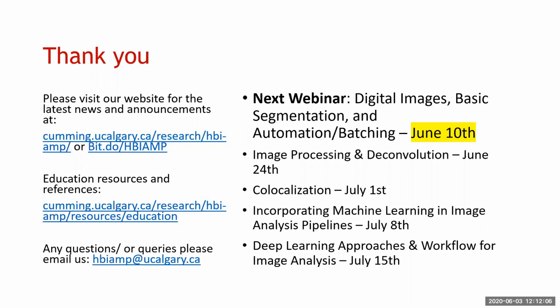Now that is if your sample can survive that, because what goes along with a cover slip is mounting media, and a lot of mounting media have kind of bleaching protection, oxygen scrubbers and reactive oxygen scrubbers to make sure that your dye, or sorry, your secondary at least, will survive the beating that it gets from the excitation source. So you do kind of miss out on that. So yeah, that's my answer to that. I hope that's good enough.